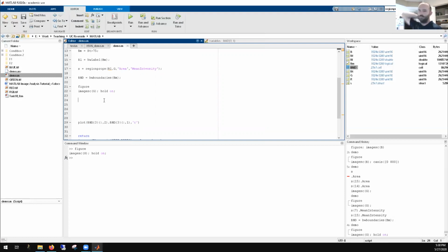Okay, well, let's actually display every boundary. So first, let's do something kind of silly. I'll do 5.